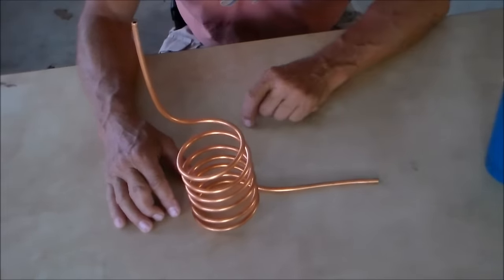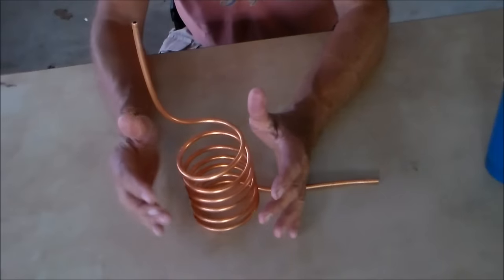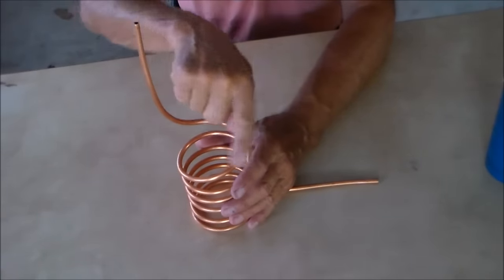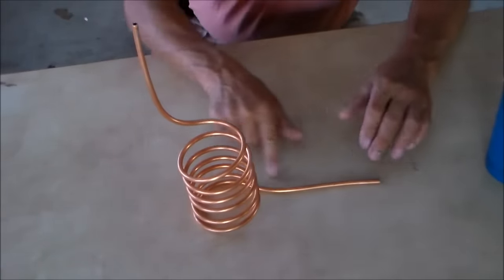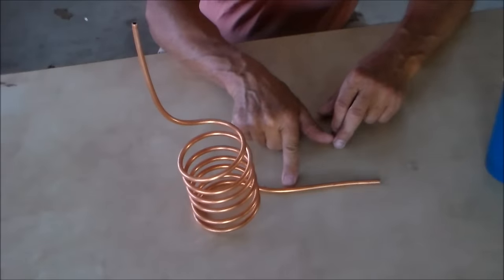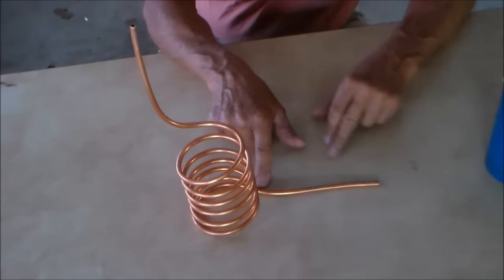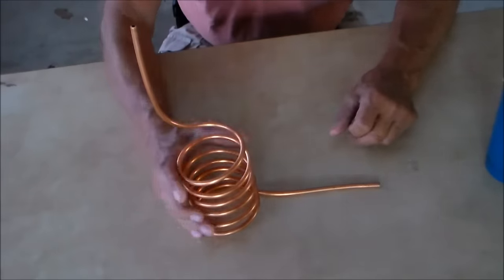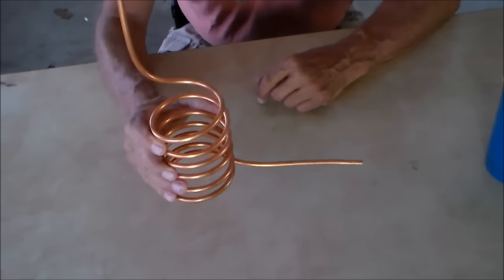That's the cooling tube. This end would exit the cooling container — this is the input. The steam will come in here and as it gets pushed through, it'll be cooled by the ice water, and then it will be dripping out of this end.